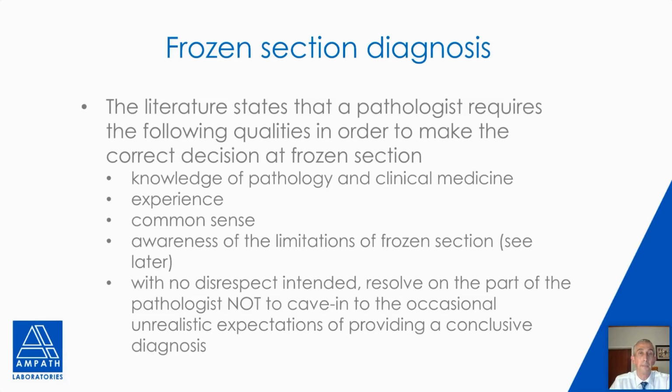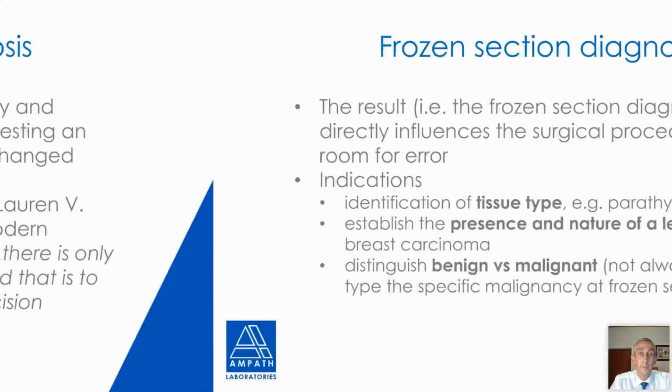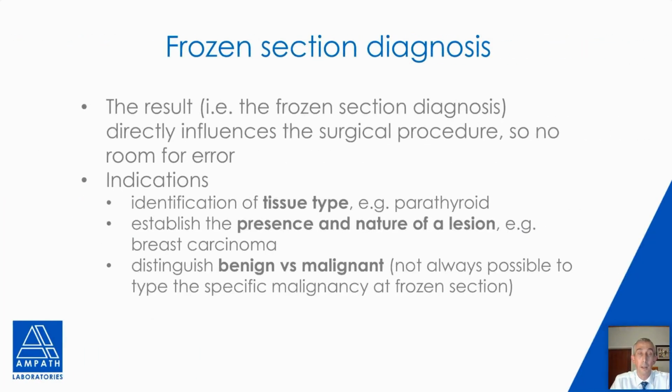With the advances in medical technology and clinical practice, the reasons for requesting an intraoperative frozen section have changed over the years. But I would like to refer to the guiding principle of one of the pioneers of modern surgical pathology, Dr. Lauren V. Ackerman. There is only one purpose in the frozen section, and that is to make an immediate therapeutic decision. The result directly influences the surgical procedure, so here there is no room for error.